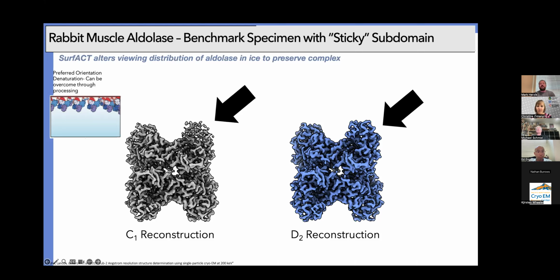The other thing we have seen, at least for one example of ours, is that when we add the higher working concentration, we can recover a population that's intact, but the population that's still broken is much larger than when we have the one-to-one mixing. So it's not a complete binary yes or no, but we have much better outcomes when you mix it carefully one-to-one.